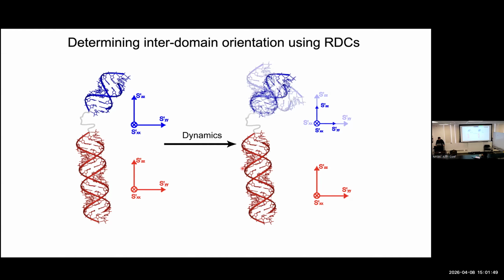You couldn't tell. Okay, so suppose I have two helices. They're the same size. They tell me they're the same amplitude of alignment. Because you're in this class, you know better not to interpret that as no motion. What would you do to test whether there is motion? Lengthen the one helix, right? So elongate one, break the symmetry if you can.